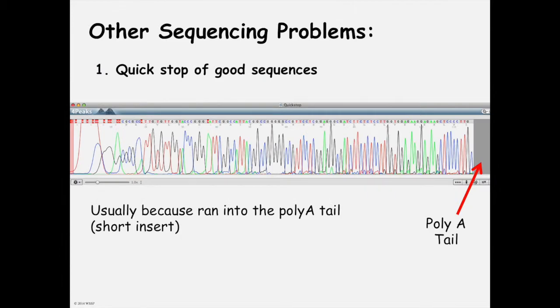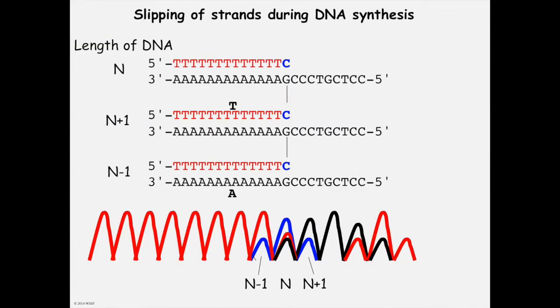We could try to come in from the opposite direction, maybe, instead of not hitting the repeat section. But if you sequence in reverse, remember that you have to get through the poly A tail, because that's at the end. So that's another repetitive sequence you can't really avoid. It's one of the big reasons why when we used to sequence in reverse, a lot of our sequences were much poorer quality.